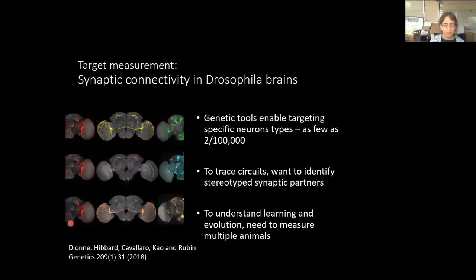So we're going to build a whole microscope, a whole imaging system around one sample, and I wanted to spend a couple minutes to explain to you what that sample is. Each one of these is a whole Drosophila brain. This is the central brain and two optic lobes on either side. What these images show is the ability, through very clever genetic tricks, to get a single neuron, or actually two neurons, one in each hemisphere of the brain, to express a protein.